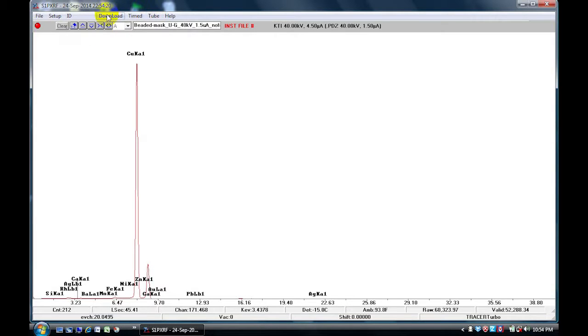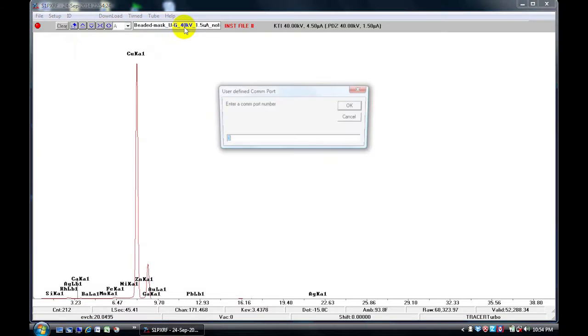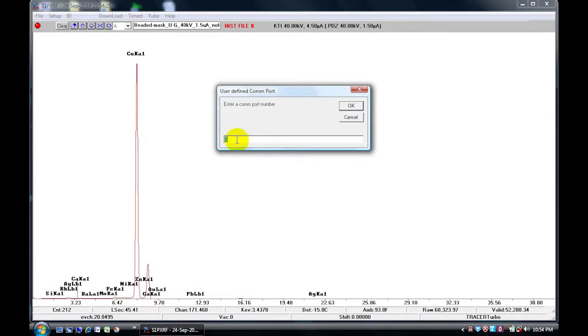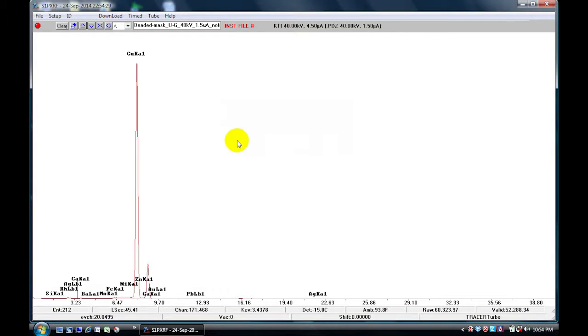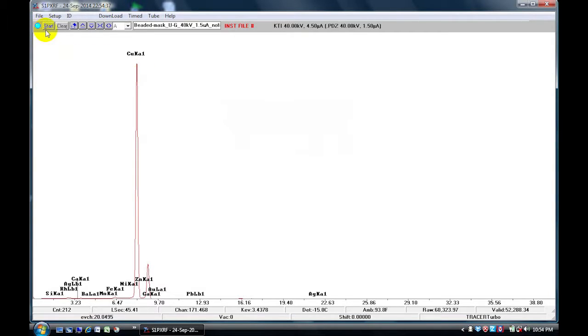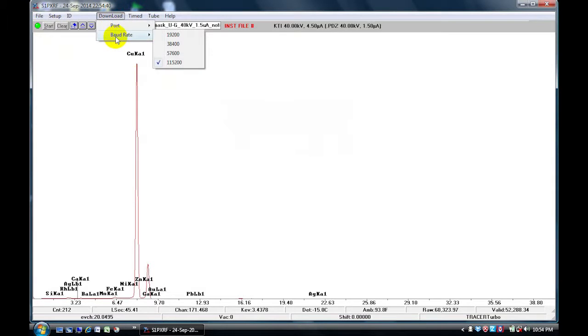So we first need to go down to the download, go to the port, click on this and enter your COM port number. For us it's number 3. Hit enter. When that is inputted, notice that the red button turns green and now we have a start button. Go back to download and to the rate and make sure that the highest rate is checked.